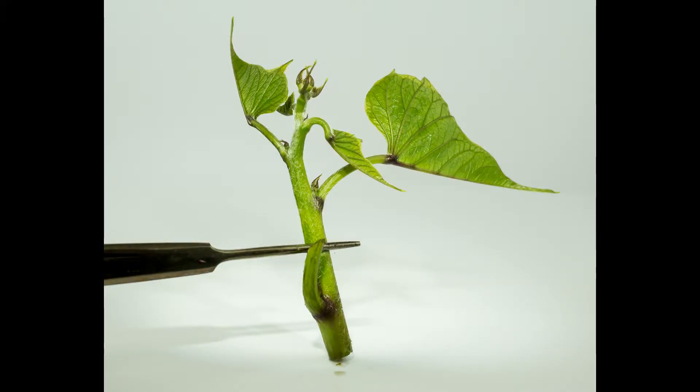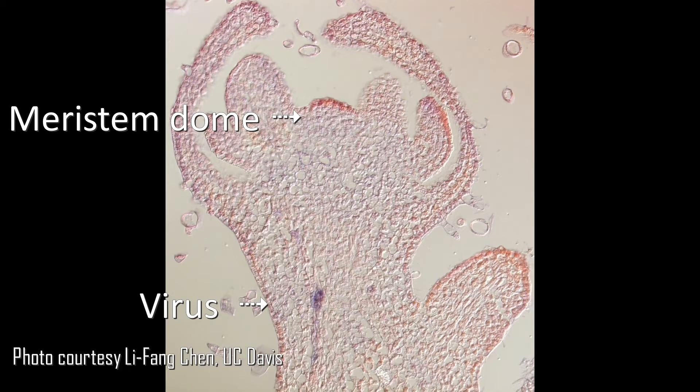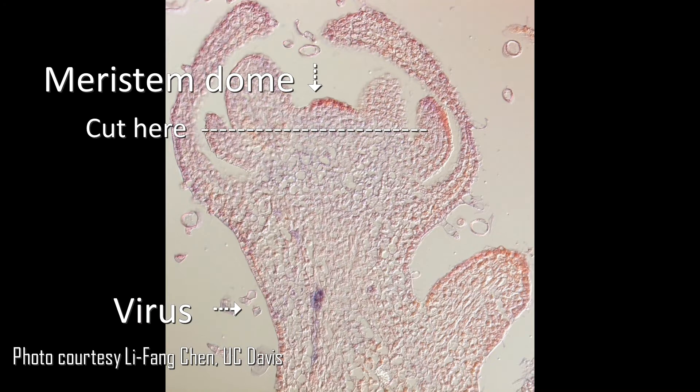We start by collecting tips from the greenhouse, bring them into the lab, and work in the hood. From this point on everything is done aseptically with sterile instruments. But before we get started, I'll show you this light micrograph of a tip. In this case the virus is labeled with a fluorescent purple dye and it's a phloem-limited virus.